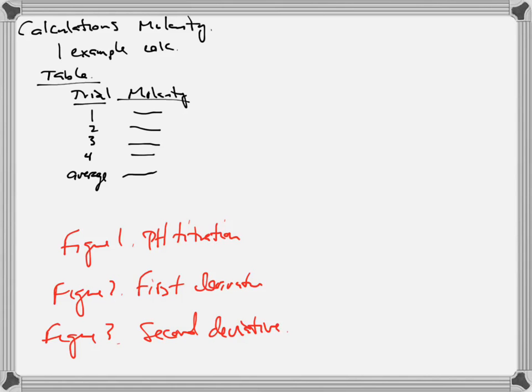If you want to go through and do a 4th figure, you can. It's known as the Gran plot. The lab procedure gives you explanations on how to go through and do that. It's entirely optional, up to you if you want to do it. Okay? I'm not going to make you do it. Each of those figures should tell me what the equivalence point is. Okay? And our sig figs should get increasingly more accurate as we go through those.